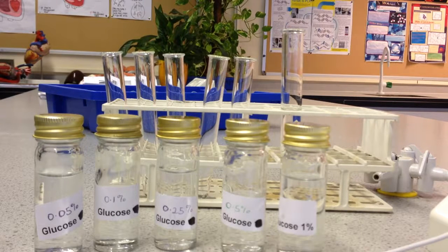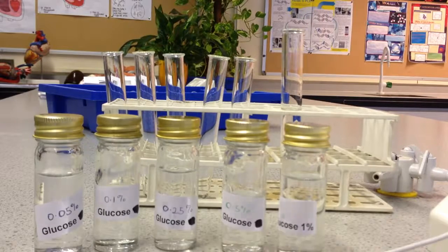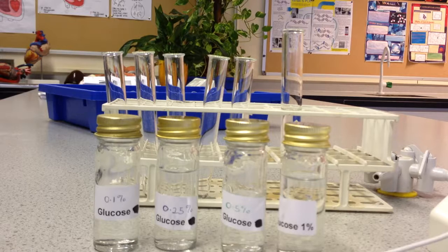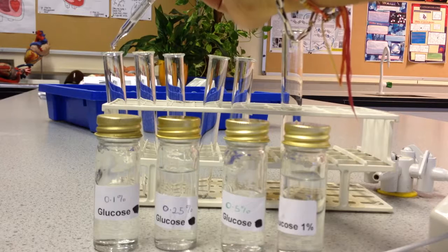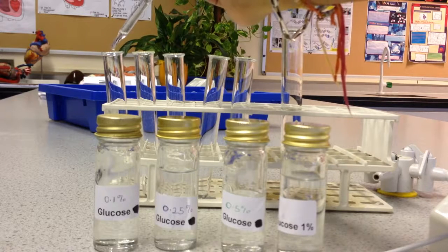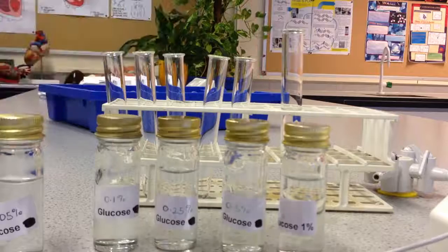And what I do then is just repeat the Benedict's test for all of those solutions. Okay, so add known amounts of each to each tube.